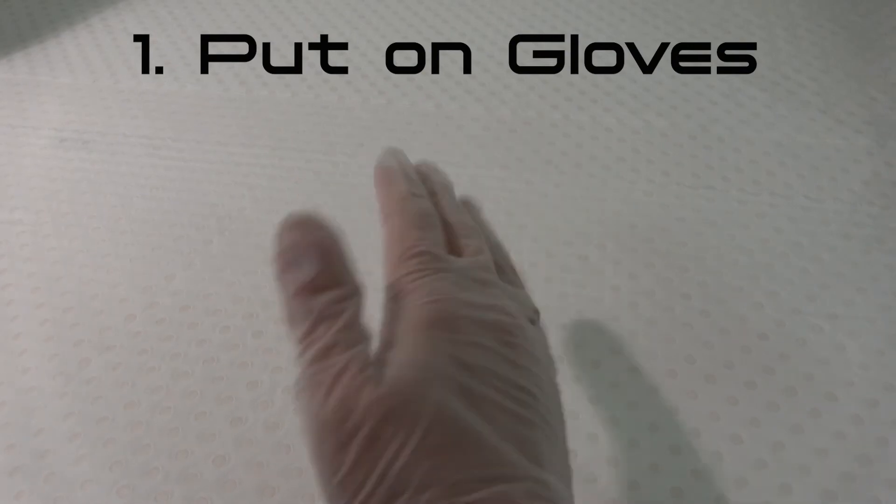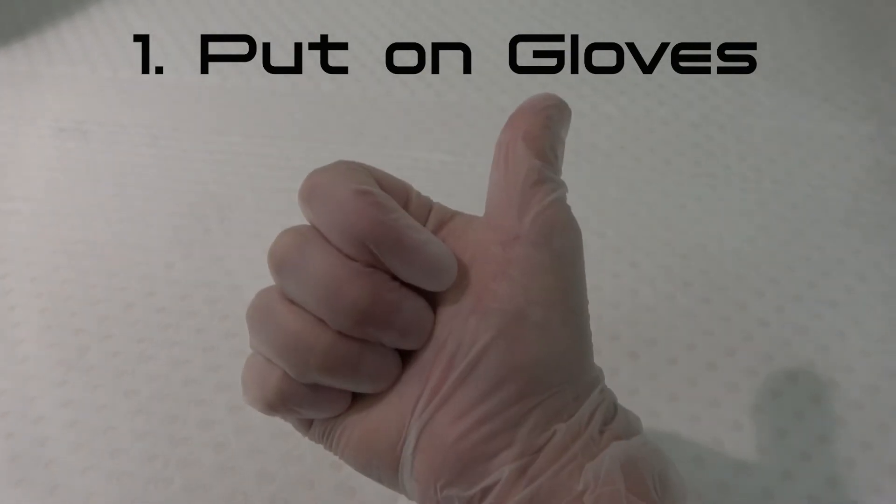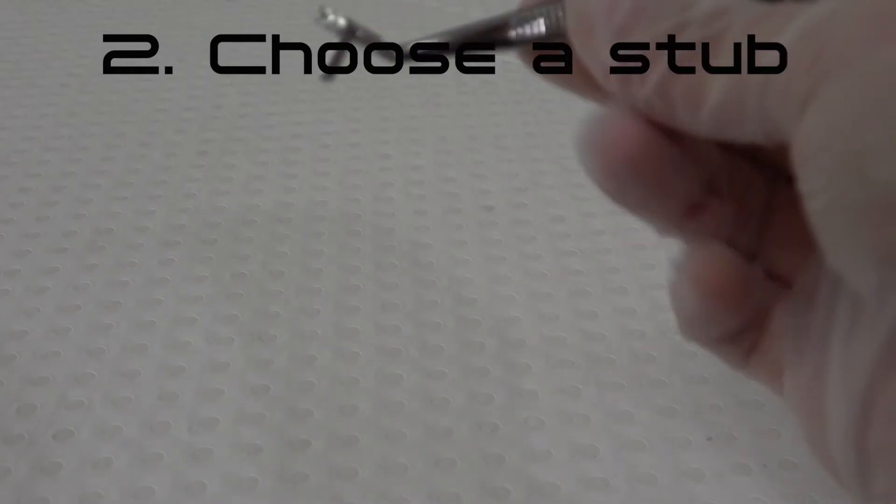Step 1. Put on gloves. Always keep fingerprints off anything that will go into the SEM chamber such as stubs and samples.